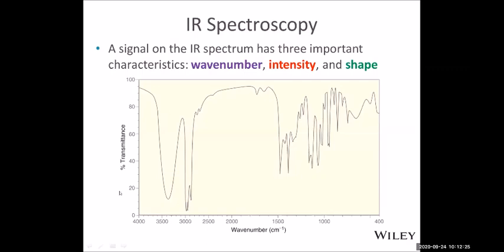So like I said, this is a real example of what an infrared spectrum looks like. The Y axis is transmittance, or how much is being absorbed. The higher transmittance means lower absorption. And typically we discuss absorption, which means the downward peaks. The longer the downward peak, the stronger the absorption. The X axis is the wave number. Wave number is the inverse of the wavelength, so the wave number is proportional to frequency. As we know, the electromagnetic radiation frequency decides the energy of the photons. So basically the X axis is, in another way, how much energy such bond vibration absorbs. These high numbers mean high frequency, higher energy infrared being absorbed. And these are the lower energy being absorbed.